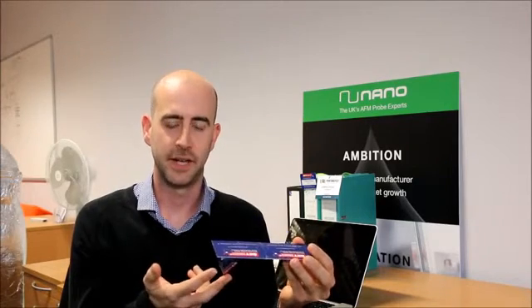And in gaining that experience, we realized we were ideally placed to start a company to commercialize our work. So we formed NuNano and we're the first UK supplier of AFM probes for mainstream applications. The AFM probe consists of the cantilever and the tip.